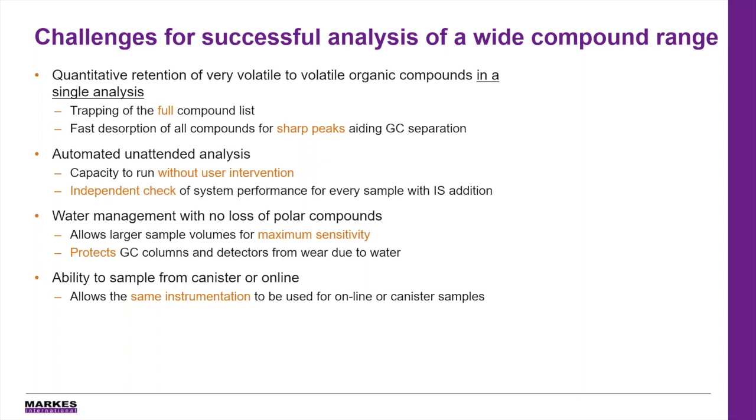So formaldehyde in canisters is stable for a certain amount of time, but there are questions about how long that time is and if it's practical for labs to really monitor formaldehyde from canisters. So being able to do an online sample directly from the air into the instrument gives people another option for formaldehyde.